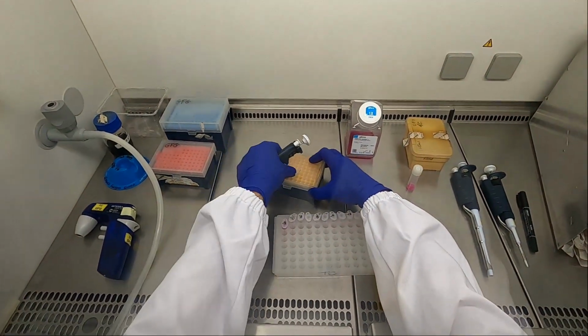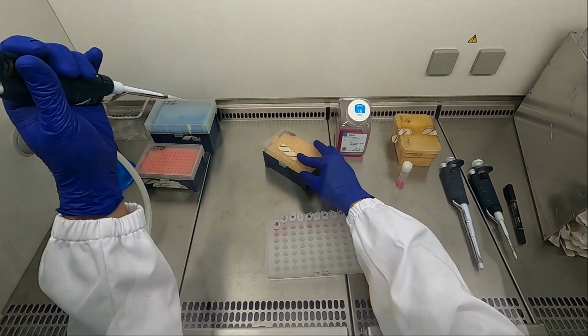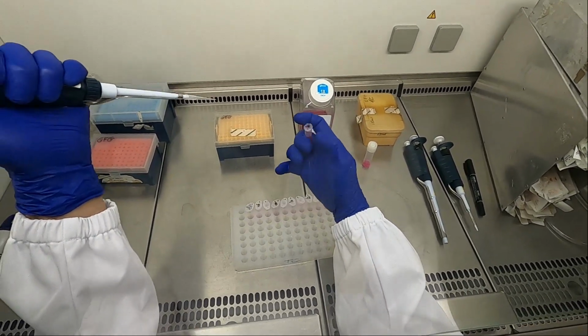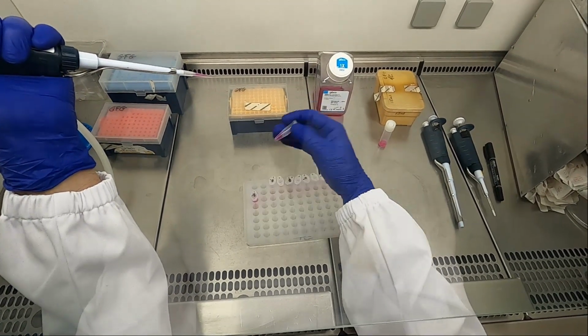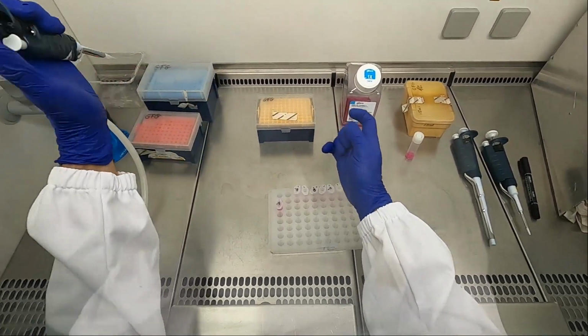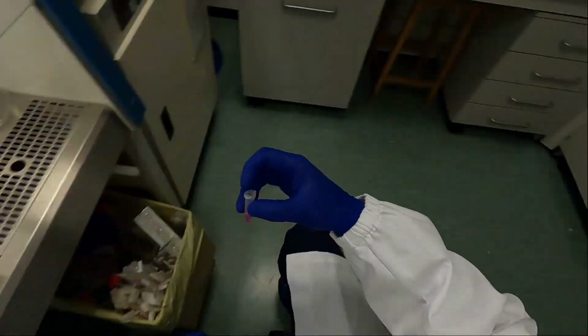So 100 microliters into 216 microliters of medium. There you go, 100 into 216. So you have 316 in total. Vortex, mix really well.